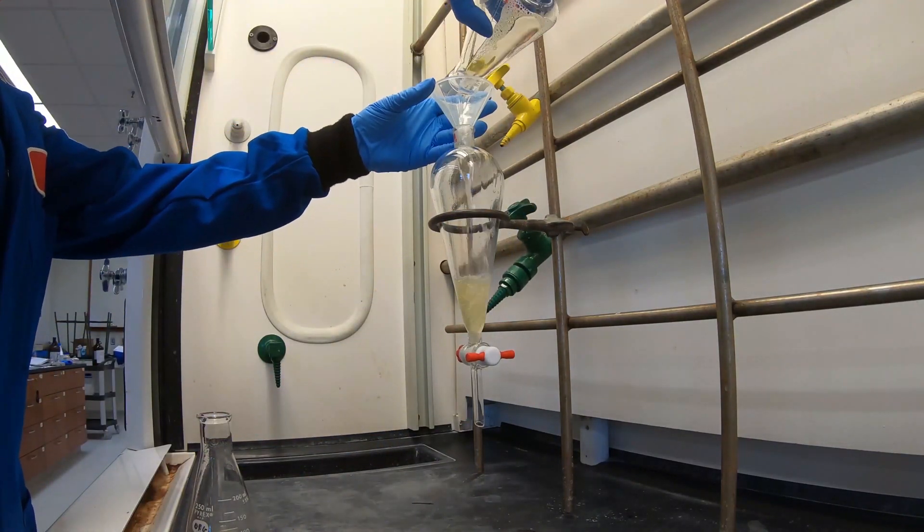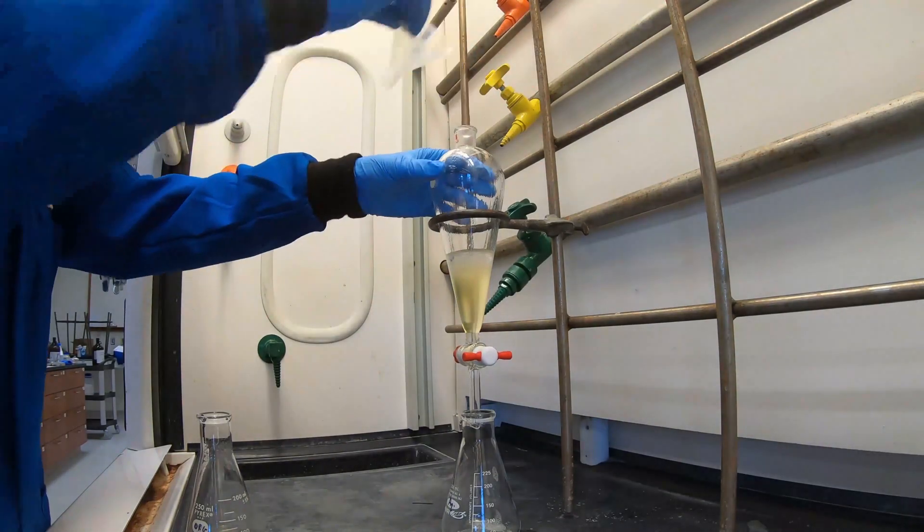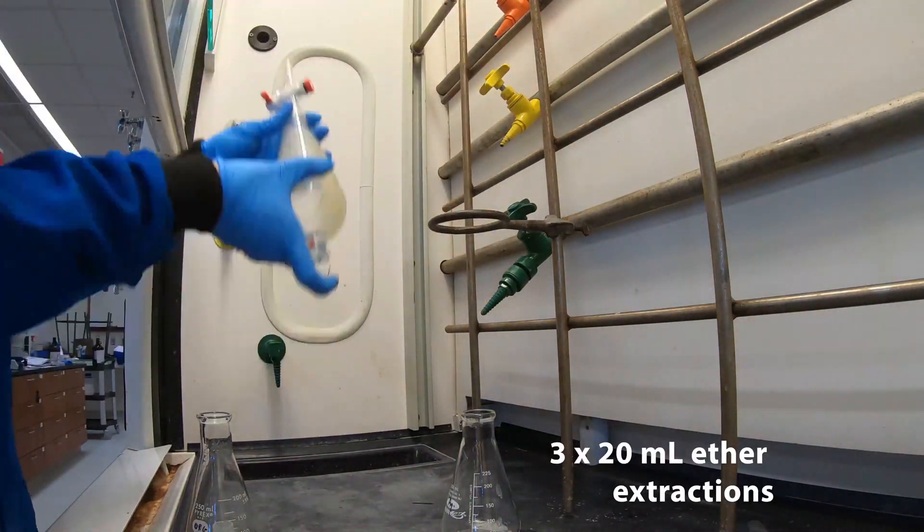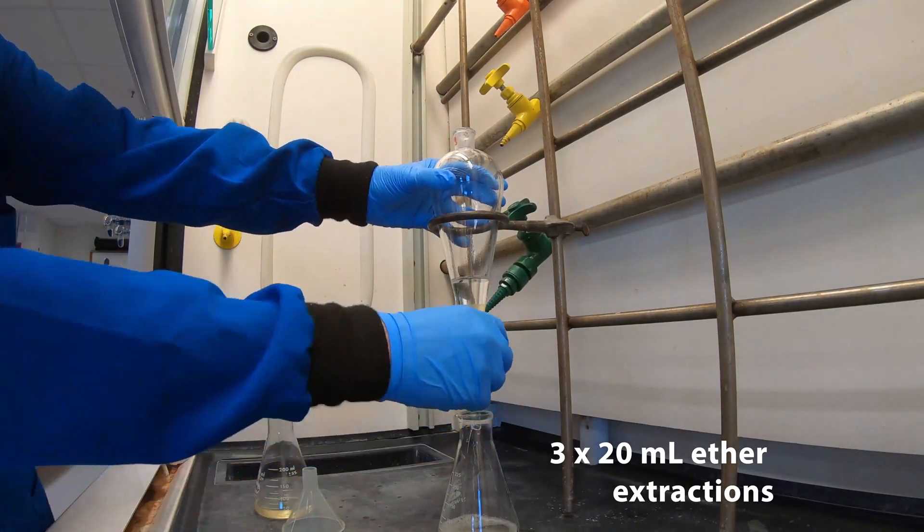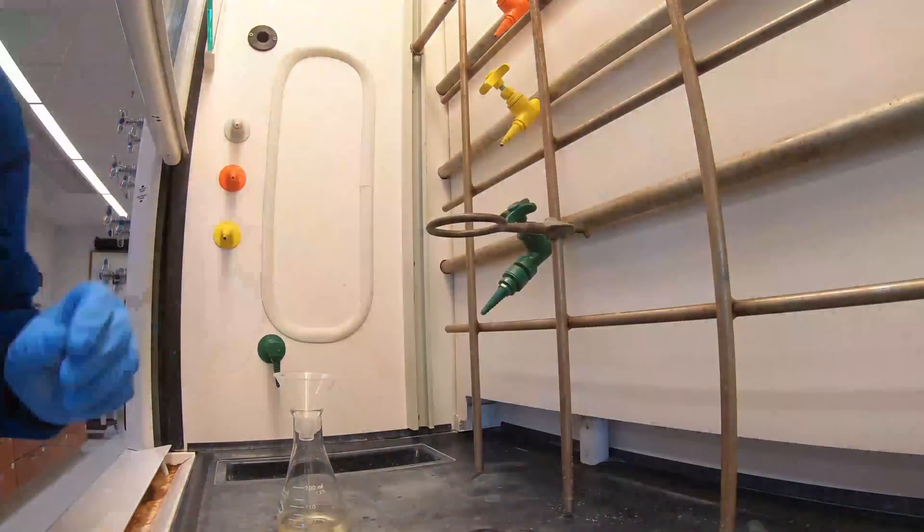Transfer the aqueous layer back into your separatory funnel. Add a fresh 20 ml of ether. Shake again. Again, collect the bottom layer in your aqueous flask. Now combine your organic layers into a single flask.